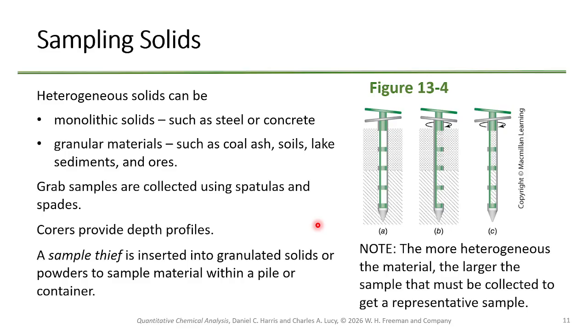All right. Now, cores are going to provide depth profiles. Everybody's probably seen cores because you've probably seen the geological cores being brought up, especially maybe in Alaska or up in the North Pole. Okay. A sample thief is going to be inserted into granulated solids or powders to sample material within a pile or a container. So this is actually going to be basically a core or a sample thief. They work pretty much the same way.